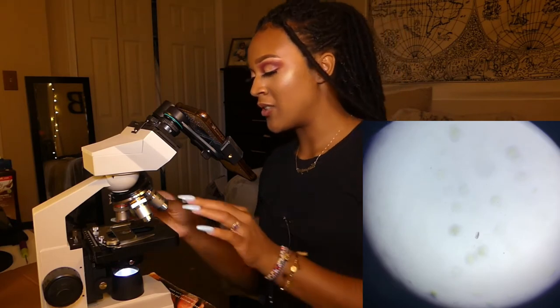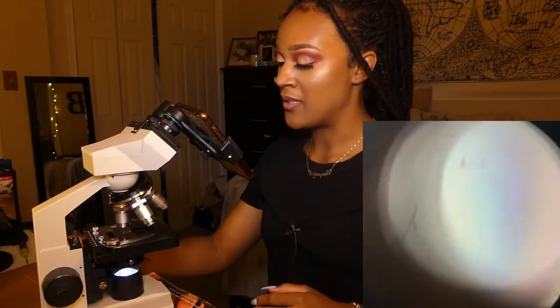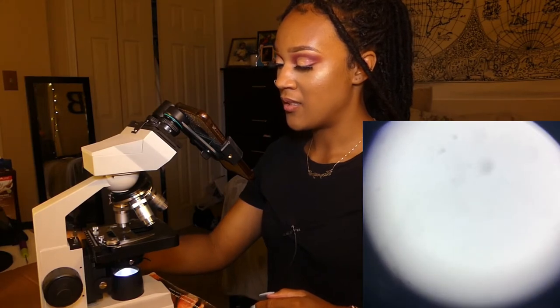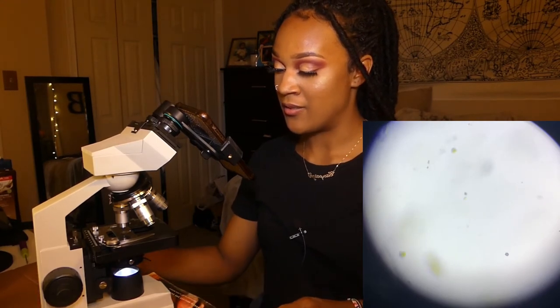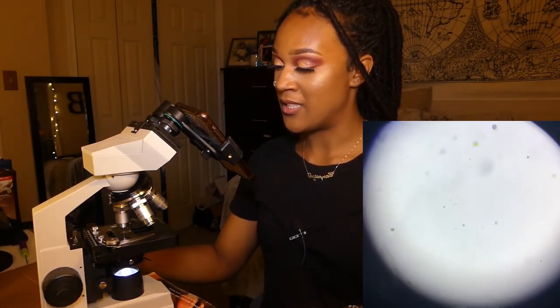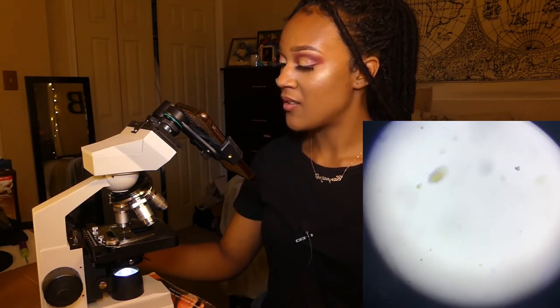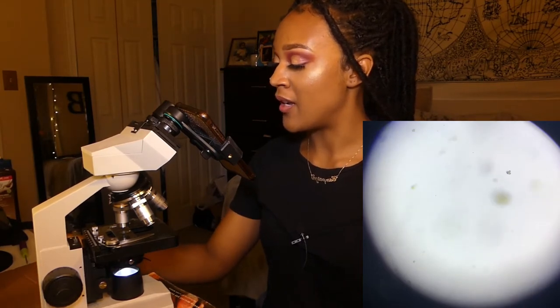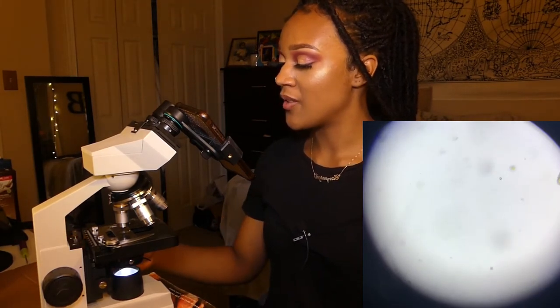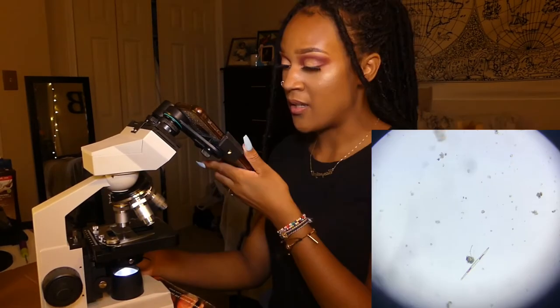I gotta try to put the cover slip on. Let's try to go to the 10x to see what we can see. It keeps moving. Okay, there it goes. See if we can catch it. So it's moving because it's a drop, and every time I move... yeah, I'm gonna put a cover slip on because it's moving too much. Okay.